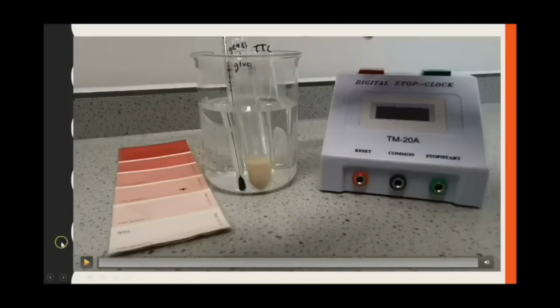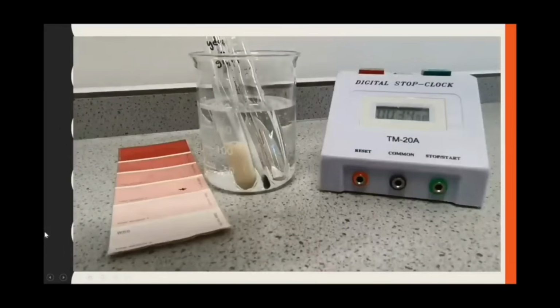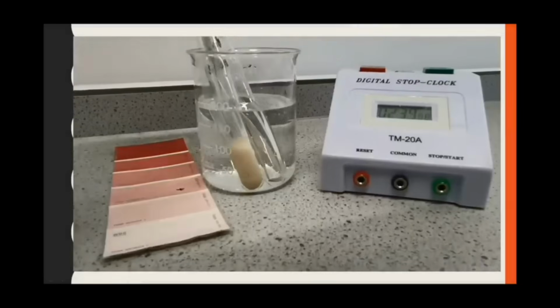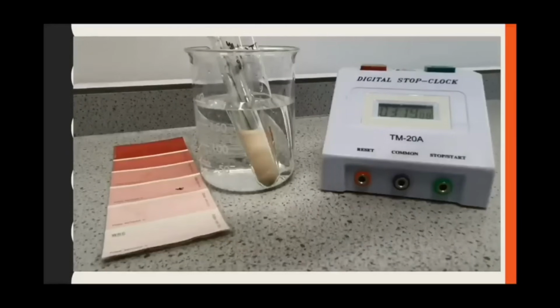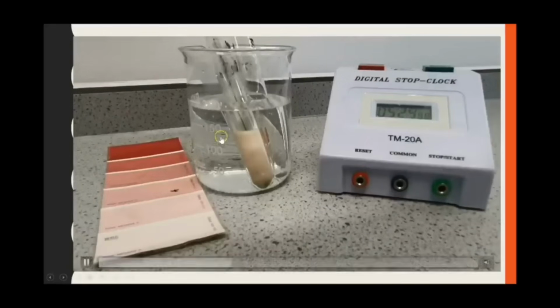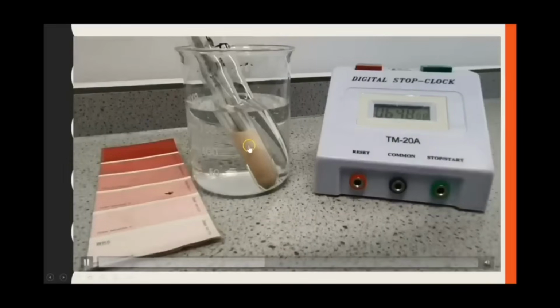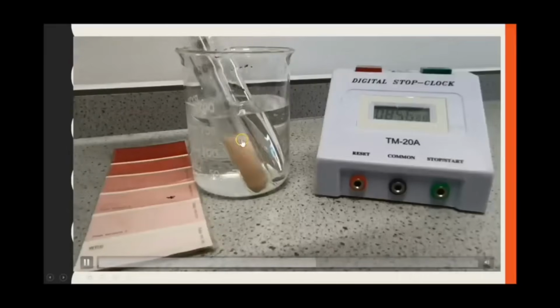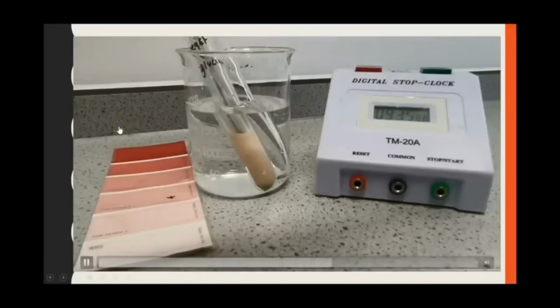So just to show you then, here is the whole reaction. So I've mixed together the yeast and glucose, and we have to provide glucose because that is one of the substrates for respiration. The TTC is already in there. Now you'll notice that periodically I'm stirring it, and that's because you can see on the time lapse quite clearly that the yeast does start to settle to the bottom if you don't stir. So we end up with lots of the single-celled organism yeast starting to sink towards the bottom, and the sugary solution and TTC will remain at the top. So we need to mix it so that that doesn't occur.